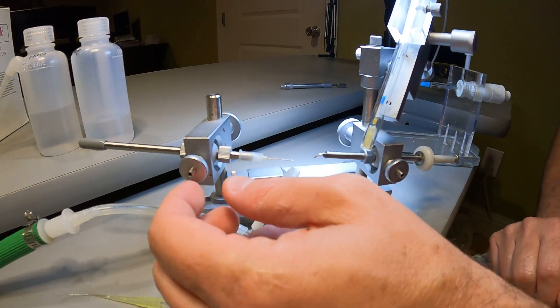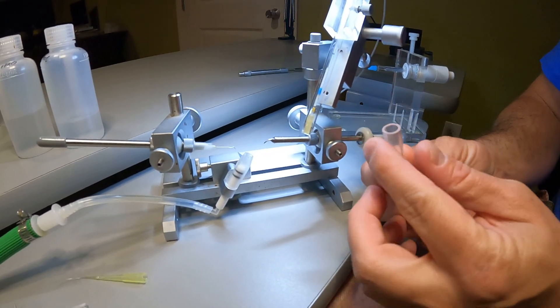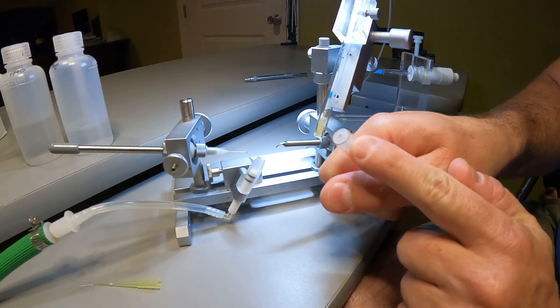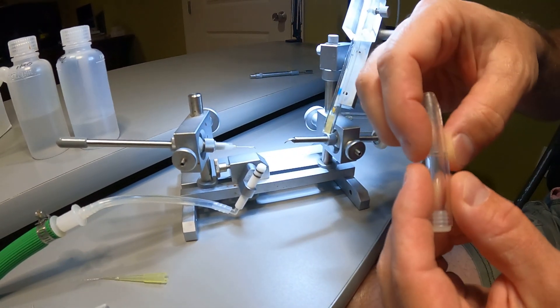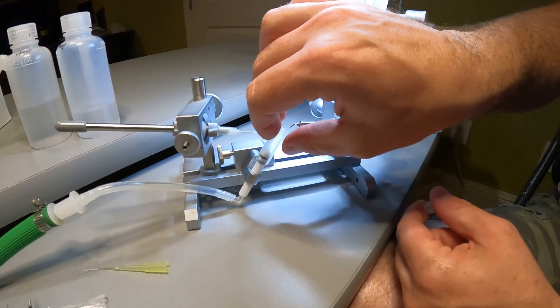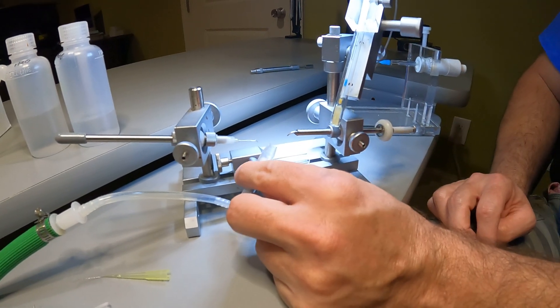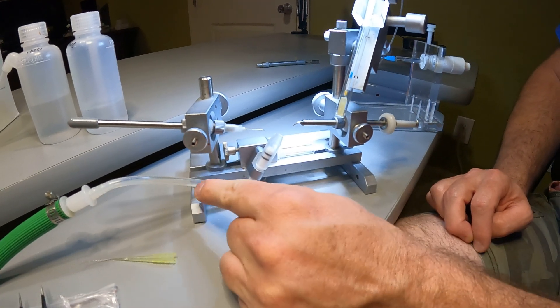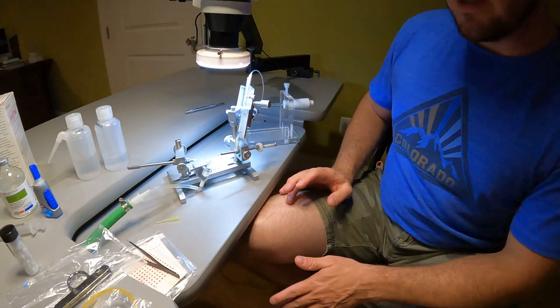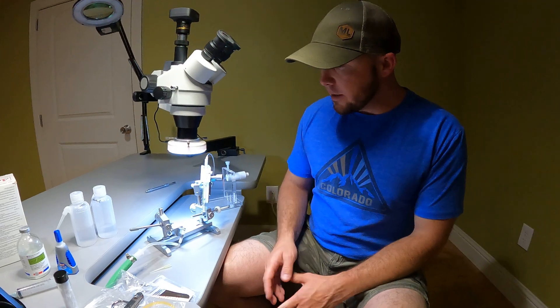There are a couple of variations you can use on sting hooks. Here's a little tube — whenever I catch the queen, I'll hold her in my hand and she'll run up into that tube. Then I'll add this one and she'll back right up into it, perfectly in position to inseminate. We then put her on the CO2 tube, which anesthetizes her and stimulates oviposition — basically causes her to start laying eggs.